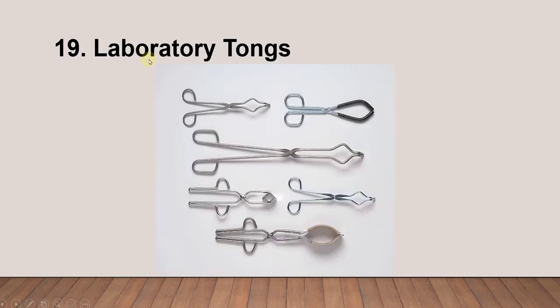Next is laboratory tongs. As you can see, we have different sizes. For example, this one can be used for an Erlenmeyer flask, and this other one can also hold an Erlenmeyer flask. We can also use tongs for the boiling flask. So you can see there are different tongs available.